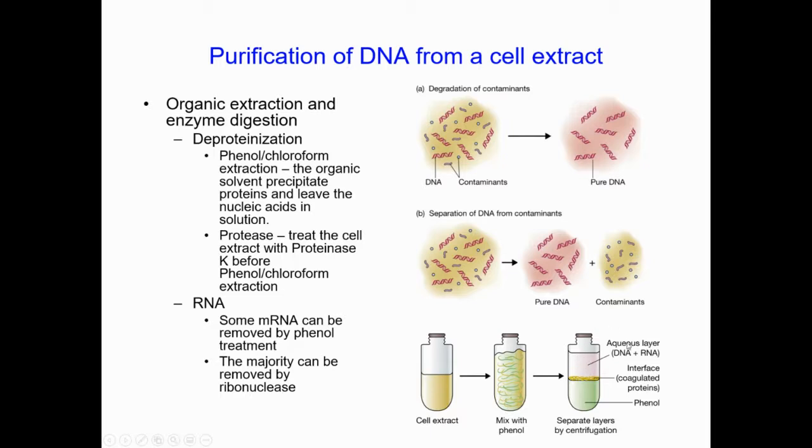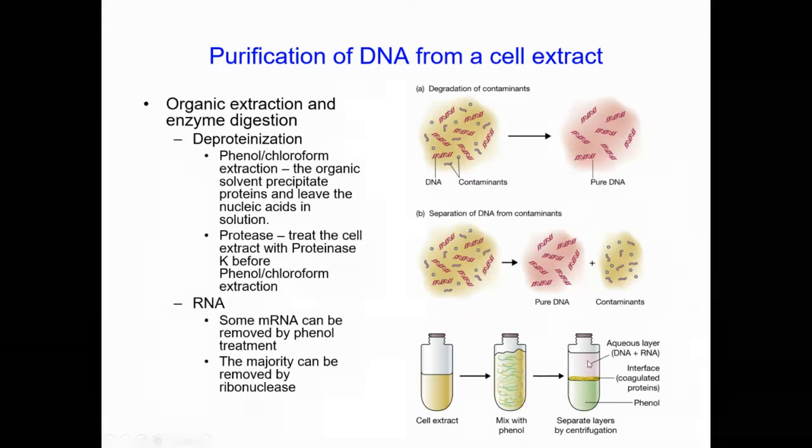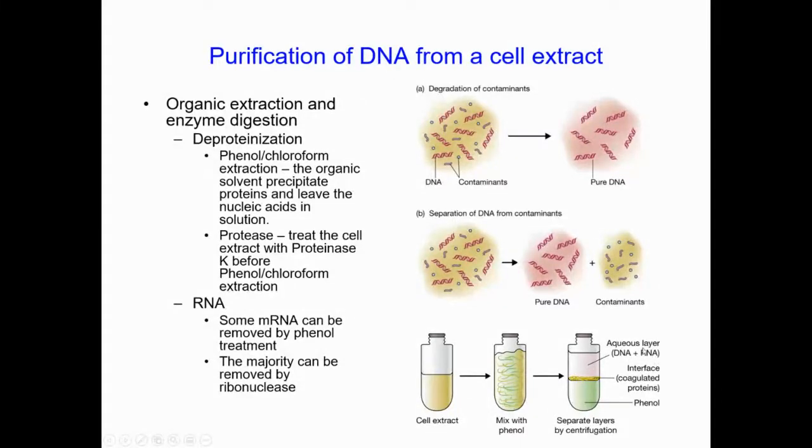And then you mix it with chloroform and then apply the centrifugation. So after the centrifugation, basically the function of the chloroform is to remove all the residual phenol from the DNA and RNA here. Okay, so that's why you have to use the phenol and chloroform, so that the aqueous layer will be pure, only DNA and RNA. And then to remove the RNA, you can use the RNase, all right? RNase, which can digest RNA and leave the DNA behind.